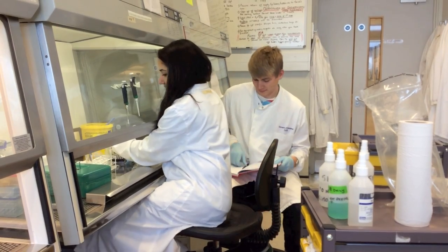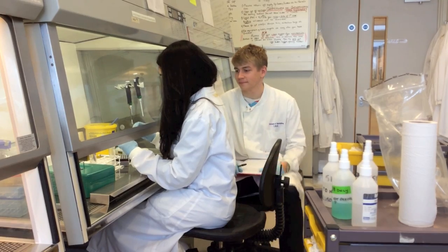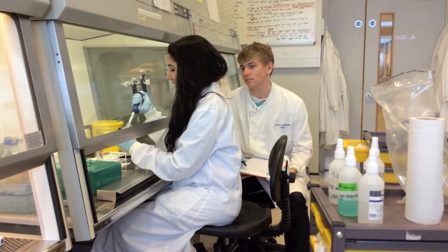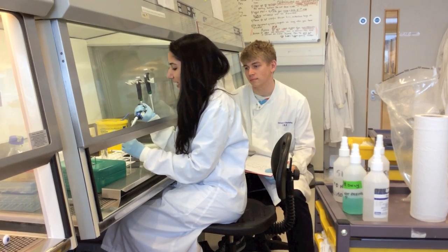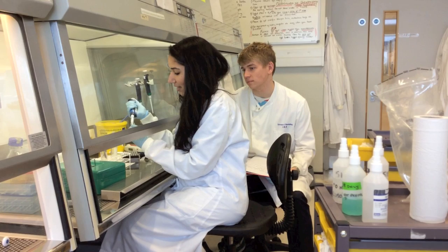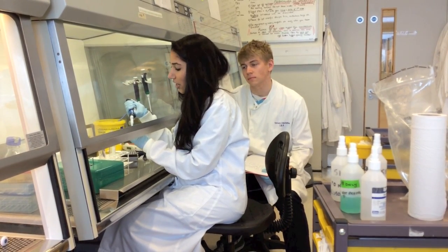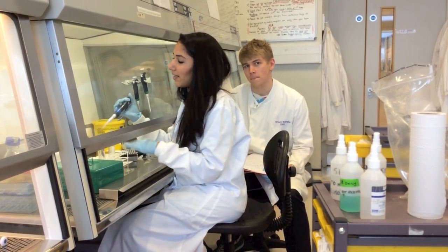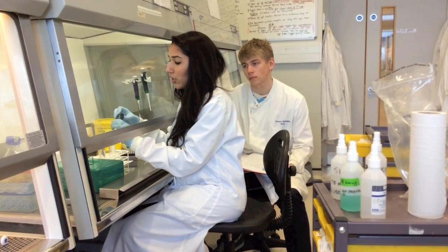So this is Sudha Praswani and Ben Wiggins, PhD students in my lab. Working very hard, as you can see today. So Sudha, what are you up to? Basically, we got a piece of normal liver tissue today from the QE, and I've just processed it and extracted the B cells from it. So was that from explanted liver that was from an operation that happened this morning? No, it was actually from a patient who underwent a laceration of the liver in an accident, so it's normal liver, and they had a transplant, so we got the explanted full donor liver.